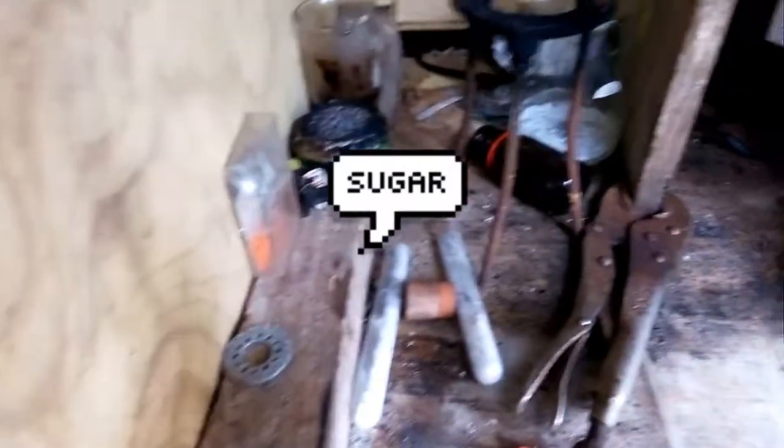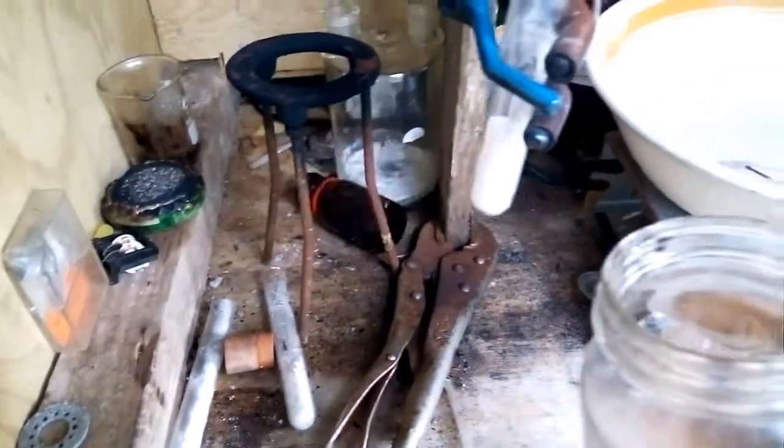Hello guys, today I'm going to show you a demonstration of sulfuric acid. In here I have sugar in this test tube and I'm going to add some sulfuric acid to it.